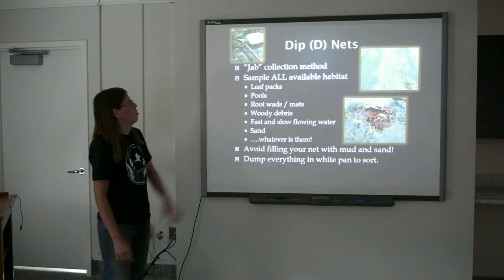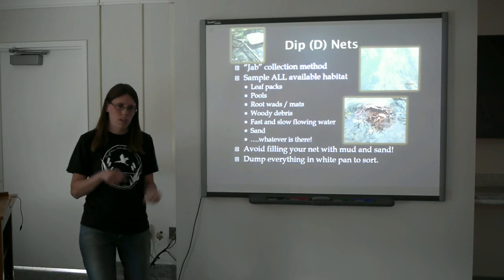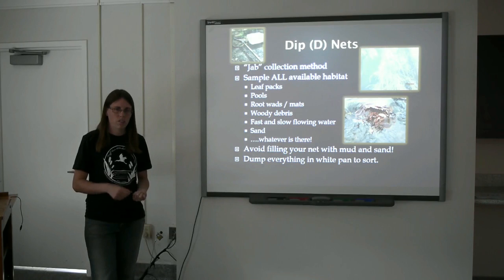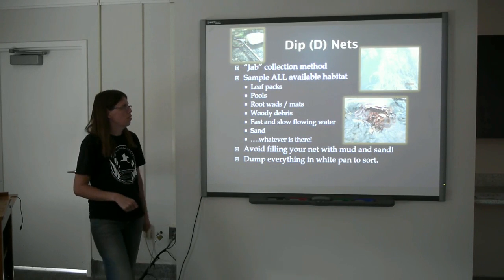These nets are shaped like a D. They're often called D nets. They're used with a jabbing collection method. We often tell groups this is not a shovel. You're not trying to collect all of the sediment in the stream. You're trying to disturb the sediment and scoop up the invertebrates that live there.